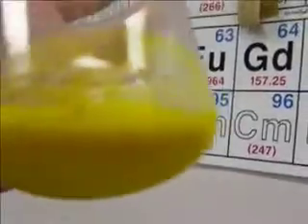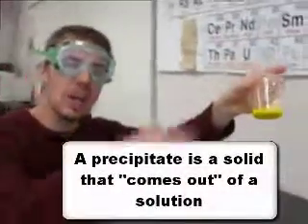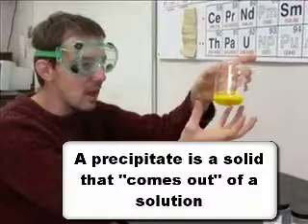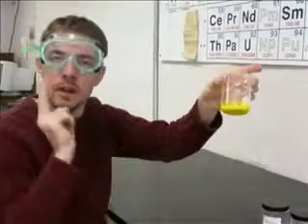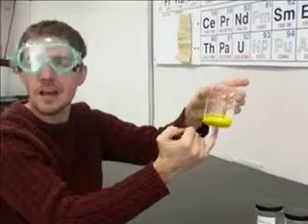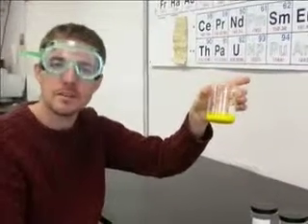It didn't just turn into a yellow liquid. You can see chunks that are settling down to the bottom. We call that a precipitate. Don't confuse that with precipitation, like rain coming down. This is a solid precipitate. The solid precipitate comes out of the solution and settles down to the bottom. So two ionic compounds in solution, mix them together, and you form a solid ionic compound that does not dissolve in water in a double replacement reaction.